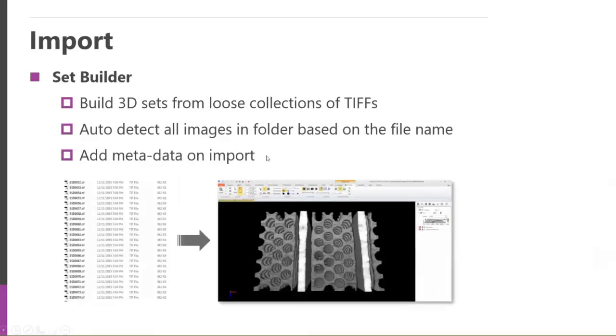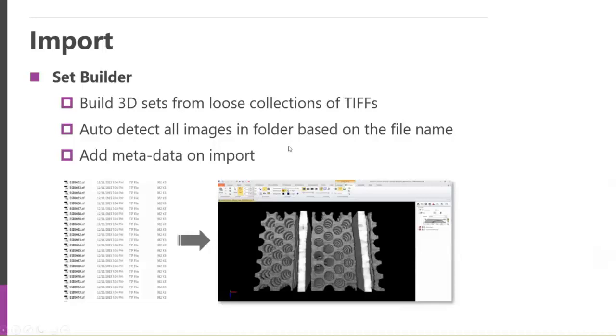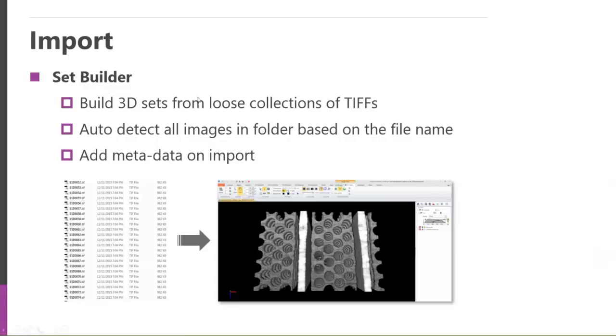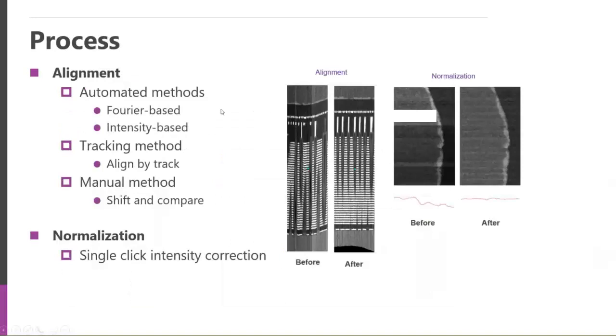As you're bringing in different data sets, if they're not in a data set format where the wavelength, calibration, Z-step, time, and things like that, if they're not defined, if they're just a series of TIFF images in a folder, we very easily and conveniently can bring in those images. And you can specify all the different calibrations for the X, Y, and Z spacing, what the wavelength is, what the time component represents, and things like that. So a really nice set builder.